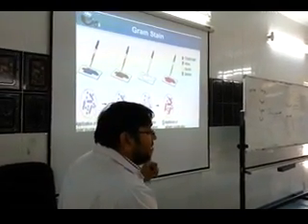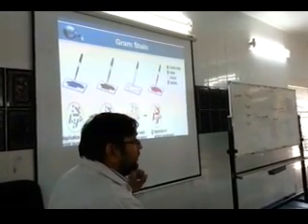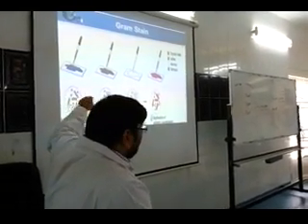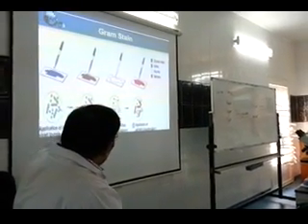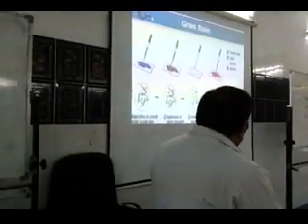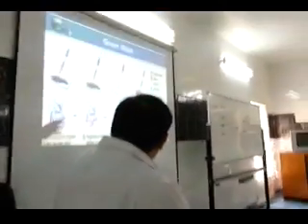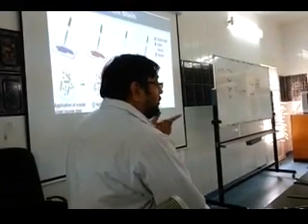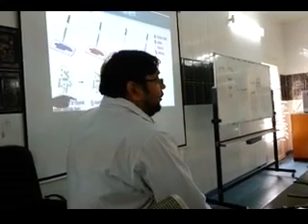You do this for 1 minute, and wash. 1 minute, wash. Okay, I'll write the steps, don't worry. So you put dye, wait for 1 minute and wash with water. Next step, you put iodine. It's called Lugol's iodine. What it does is make a complex that fixes into the peptidoglycan layer so it cannot come out, and all the cells become blue-black. You do this for 1 minute and you wash. 1 minute, crystal violet, wash. 1 minute, Lugol's iodine, wash.